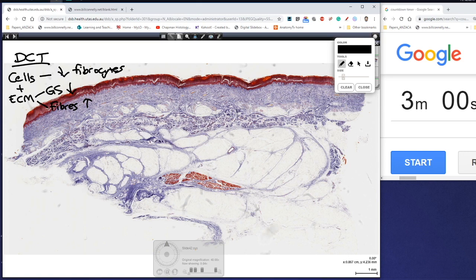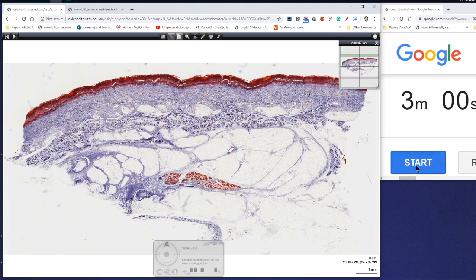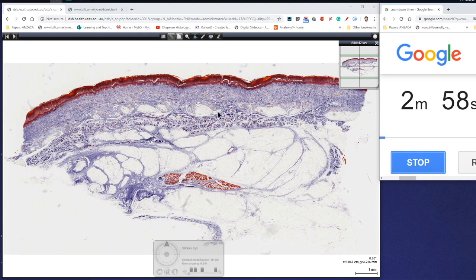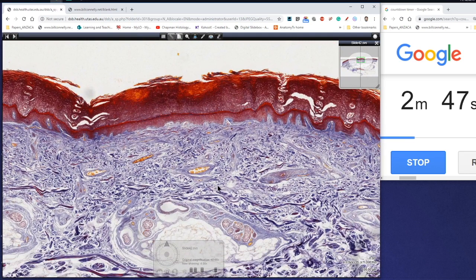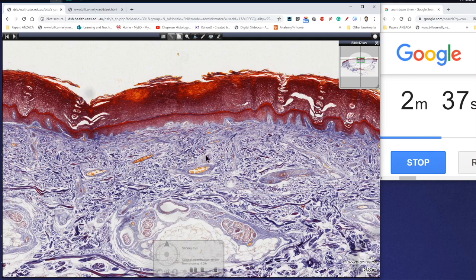So we're going to be looking at dense irregular connective tissue in this slide here. This is a trichrome stain section of thick skin. We can tell it's thick skin because of the very well-developed stratum corneum of the epidermis. With trichrome, you can see the epithelium is stained red, and the connective tissue fibers are stained this purpley-blue color.